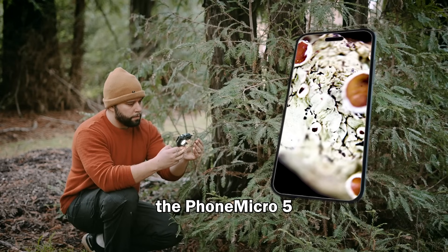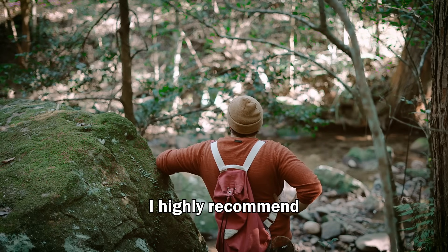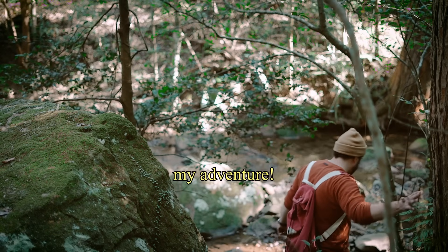Such a cool device — the Phone Micro 5 by Apexel, compatible with any smartphone. I highly recommend having one of these, because for me it helps me tell the story of my adventure.